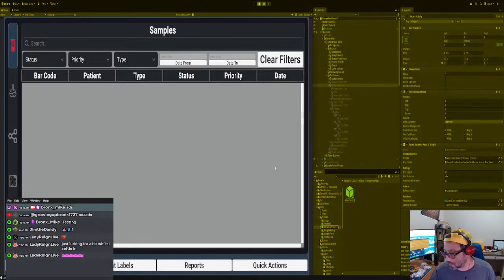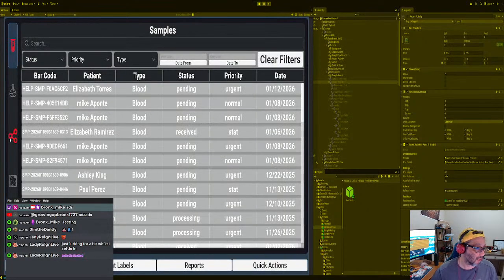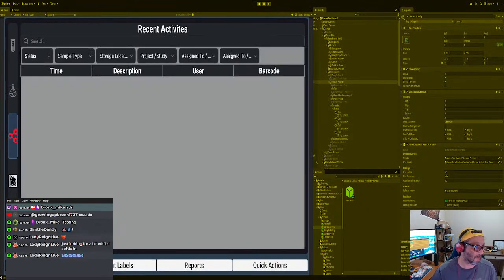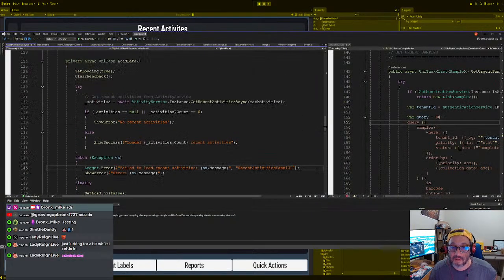Right, it's loading up. Okay, recent activities. Oh, none, which is good. Failed to load. Okay, why? Have I looked at it? We have a reason why we don't have it, because we have a limbs event bus, recent activity panel. Okay, so we have this load data, activities data.